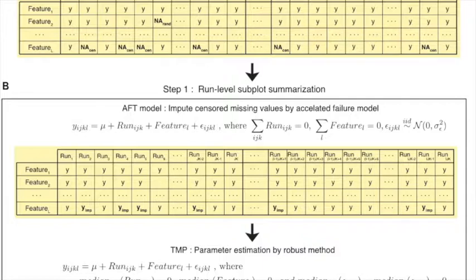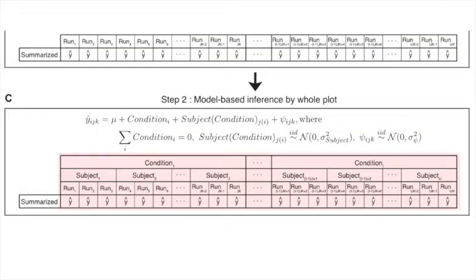And so now this is the summary data set where we can just use this to draw heat maps or things like that. Or we use the next step to work with the biology side, where we have one number per protein per run. We can now do a t-test if it's a simple two-group comparison, or build more complicated linear mixed models if it's multiple conditions and multiple types of replicates.